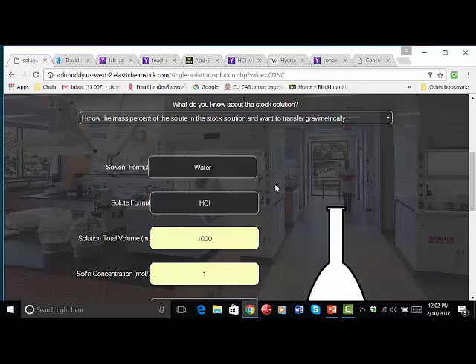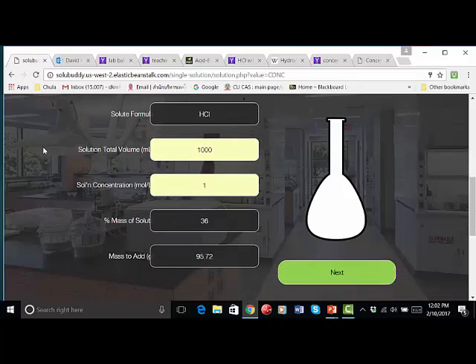You see one other thing that the website did. I guess you're seeing the phases of development that we were in last time as we got this far. Basically, we have entered the formula for the solute, but the website is no longer asking for the molecular weight of the solute. So that's fine. It can be eliminated from those other pages as well, just to streamline this till we get it all working.